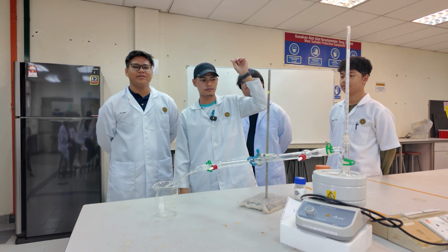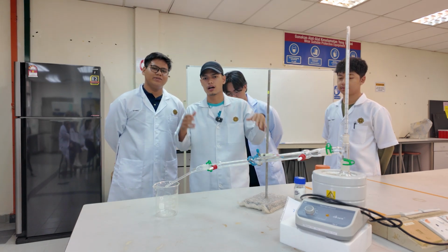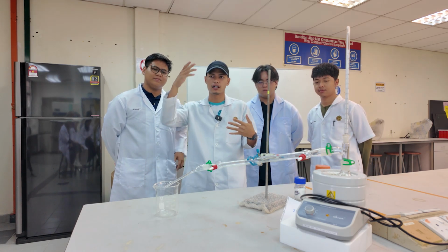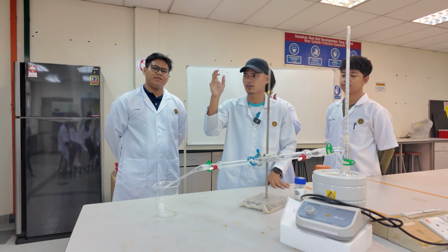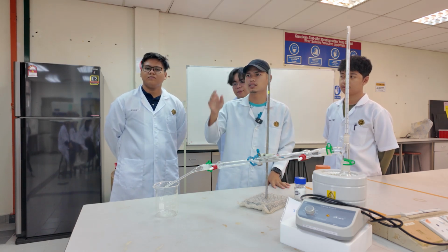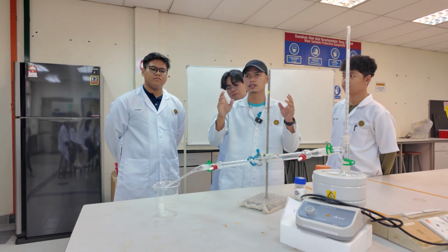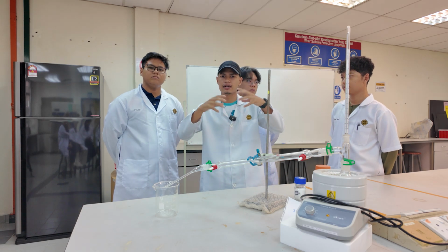When we flow the mixture into the gel filtration column, the bigger molecule will flow the fastest, because the smaller molecule will be trapped inside like a net.